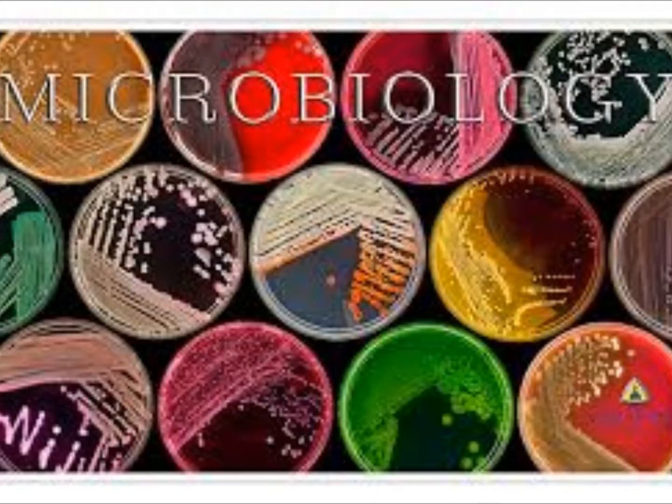The QC slide already has methanol, so you're not going to do anything to it right now. Set it aside. The QC slide, we're just going to stain it with our organism. And the reason why we do that is we want to see if we have stained the organism properly. Did we over decolorize, under decolorize? You can't make an assessment of the microscopic morphology if you haven't stained it properly. So that's why we're running a QC slide along with our organism gram stain.